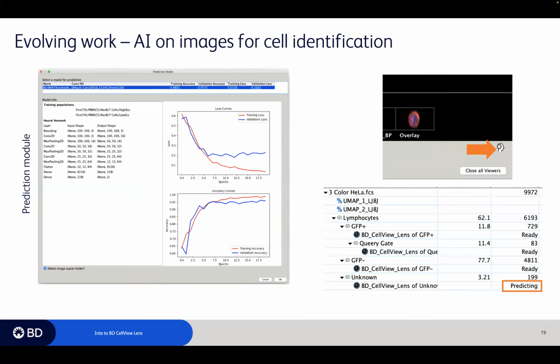So the workflow that I pointed out was that we could pull up some graphs, mouse over them, identify interesting cells, pull up a wall of cells, and try to use some gates to isolate the cells we want from the cells that we don't want. Probably the better long-term plan is to do that once, to find a small population that's exactly what we want, and then ask a neural network to learn what those images that we like look like compared to images that we don't like, and then just go in and find other images that look like the ones we want and pick them out.